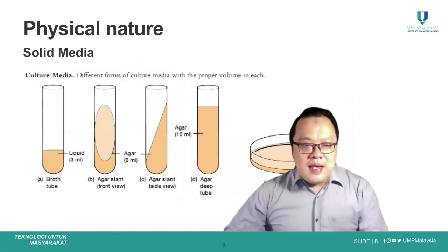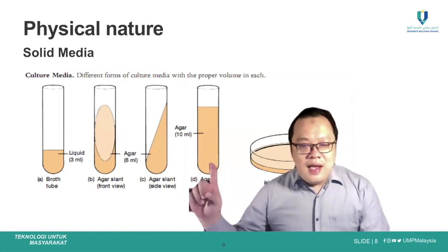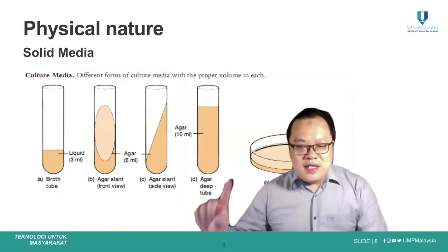In the solid media that we're going to prepare in this lab experiment, we're going to prepare the agar slant, agar deep, and the petri dish.